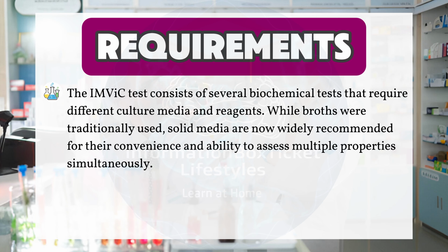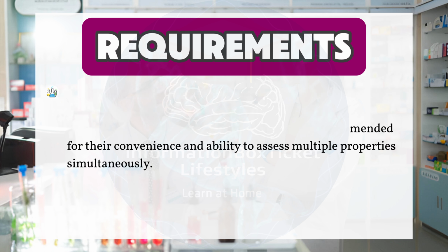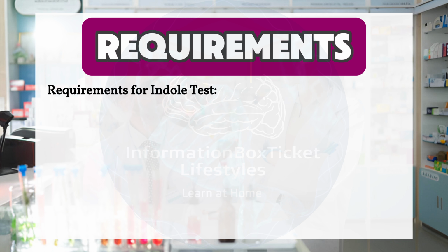Requirements for IMViC test. The IMViC test consists of several biochemical tests that require different culture media and reagents. While broths were traditionally used, solid media are now widely recommended for their convenience and ability to assess multiple properties simultaneously.